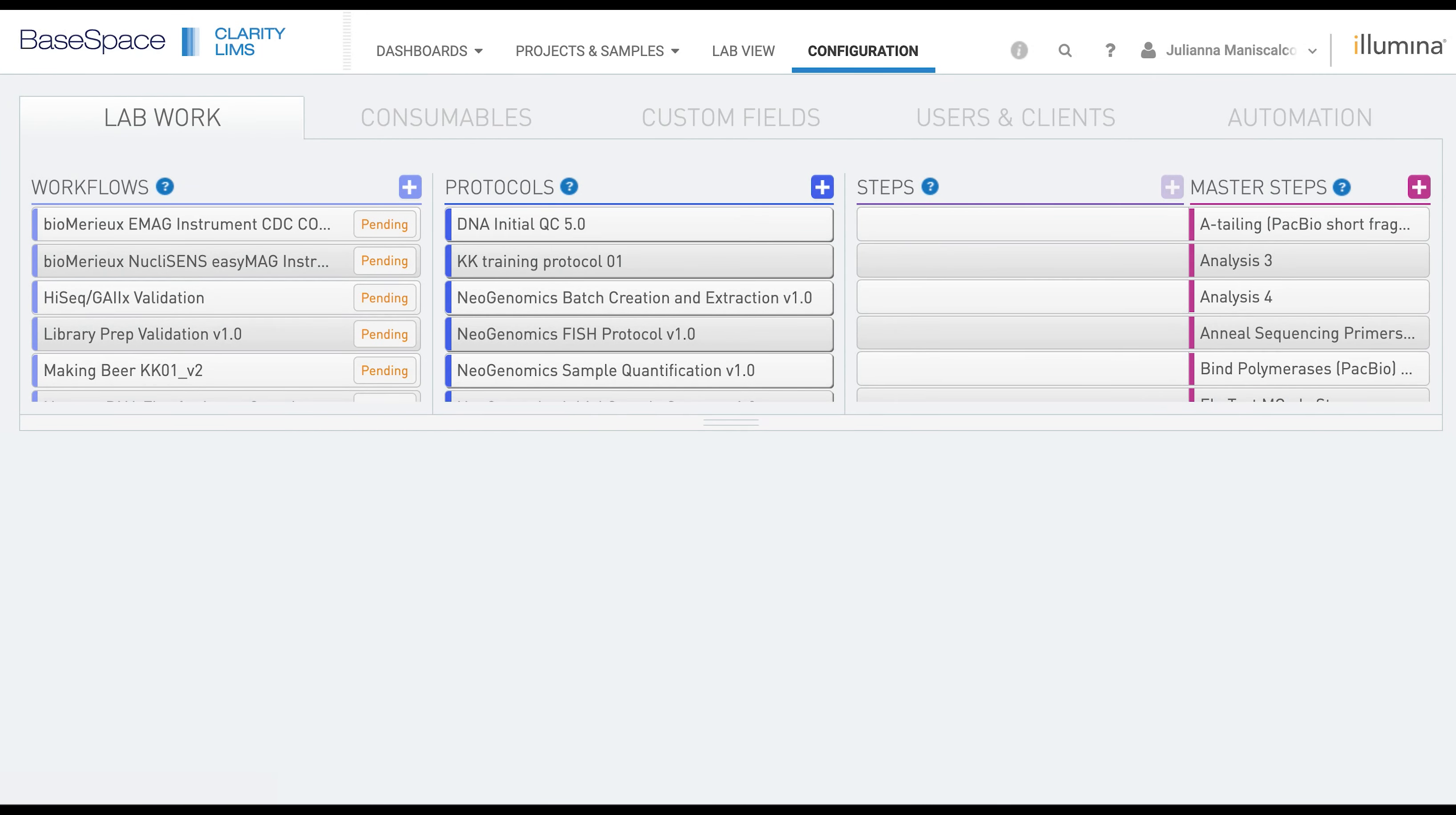In this video we are going to review how to configure and track an instrument such as a liquid handler in Clarity LIMS.